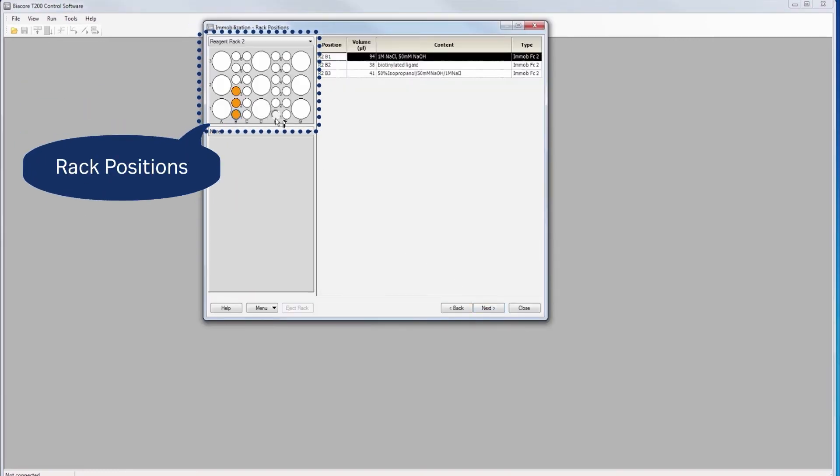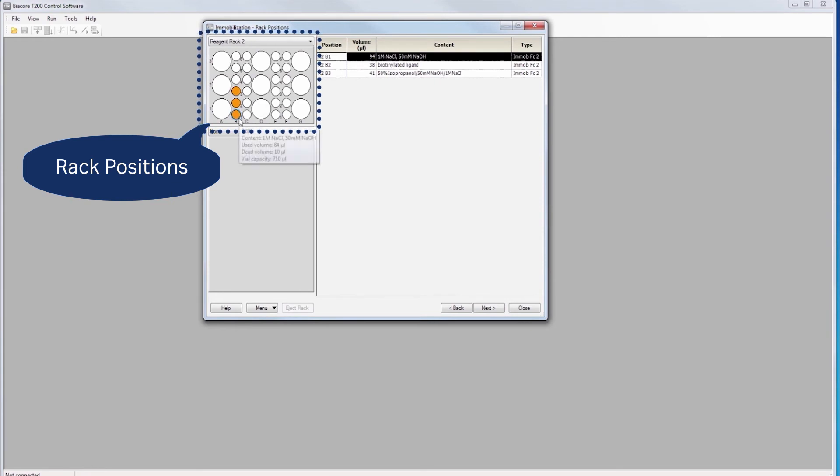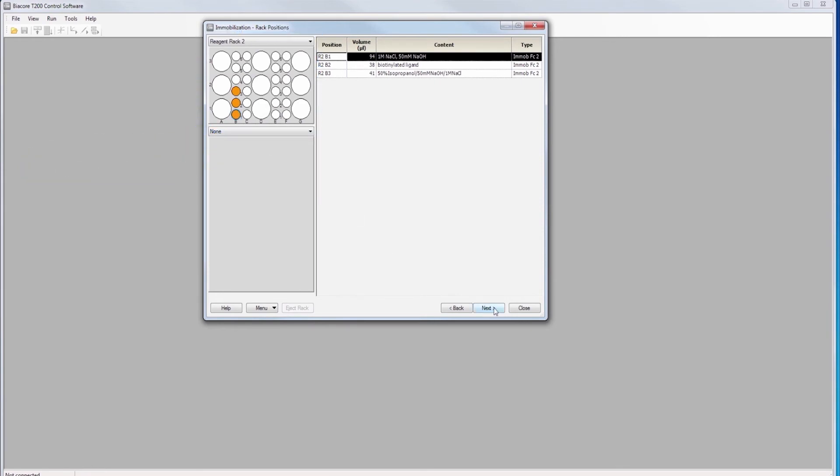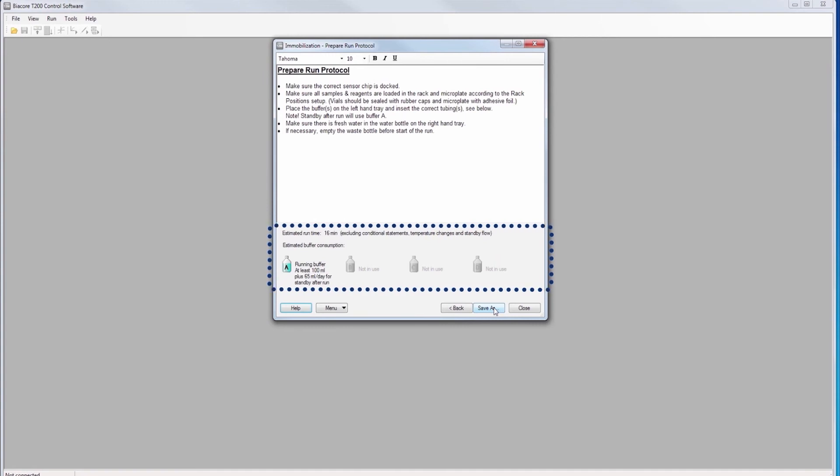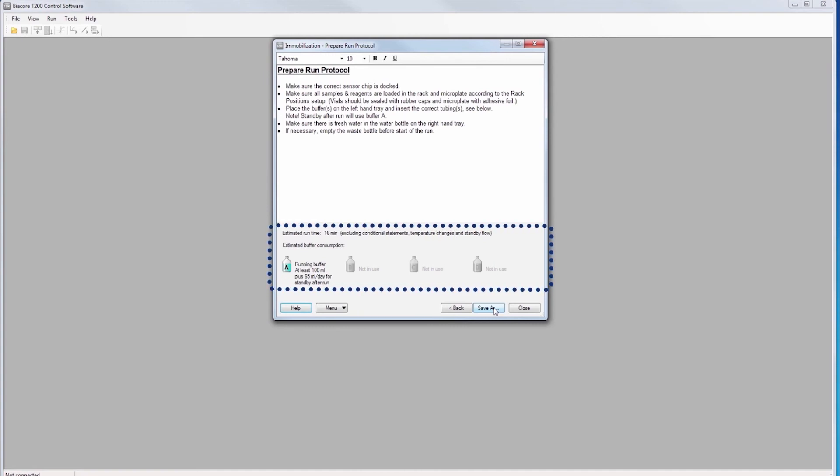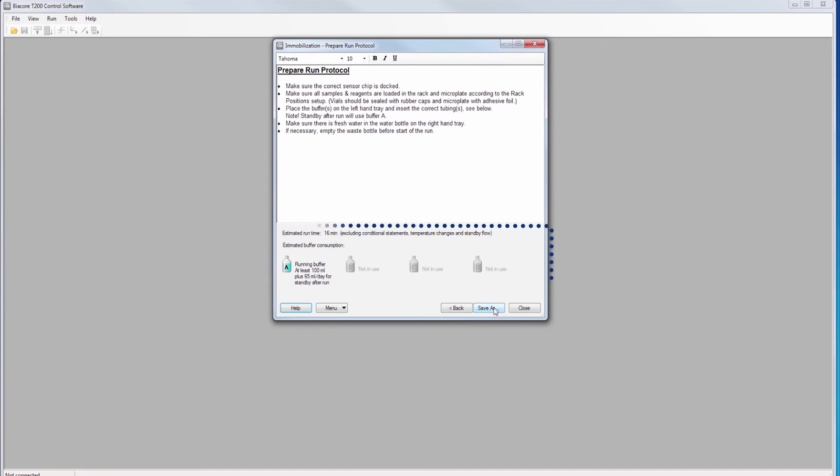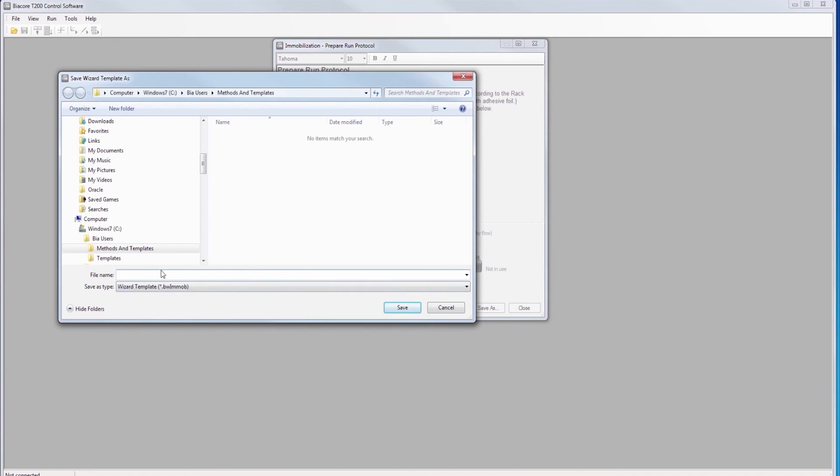The default position of reagents can easily be altered. Check the run protocol before start to ensure reagent volumes and estimated run time. Name your run file and method and save in an appropriate folder.